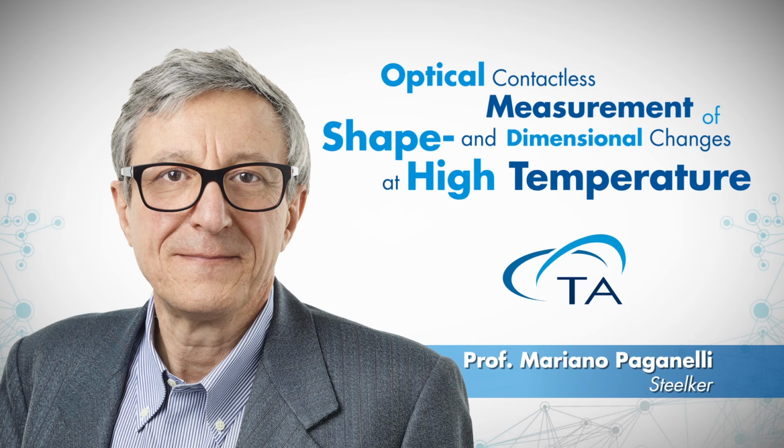Okay, thank you. So this is from Joseph. This is a classic one. What are the pros and cons of classic push-rod dilatometry versus optical dilatometry? Also, thanks, Joseph, because this was another good one. Well, this is the classical doubt, when somebody wants to buy a dilatometer. Which one is the best, mechanical dilatometer or optical dilatometer?